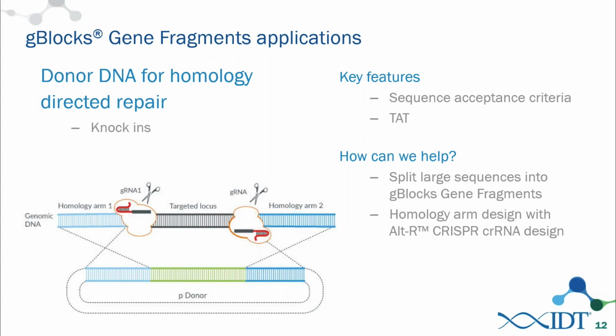Very related to that, Adam, can you say anything more about the stability of gBlocks gene fragments when they're dry versus in solution as far as stability? Sure. Yeah, and this is kind of interesting. gBlocks themselves, again, are very stable. The bigger issue that we've run into with gBlocks is that the long linear DNA tends to be sticky and tends to adhere to tubes.